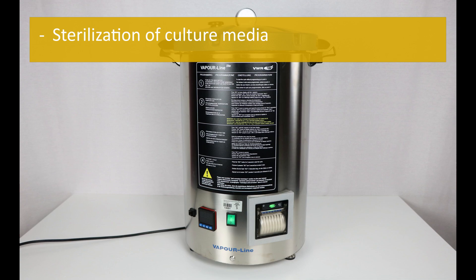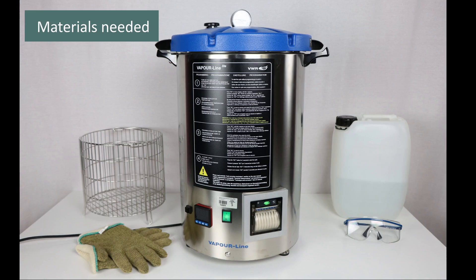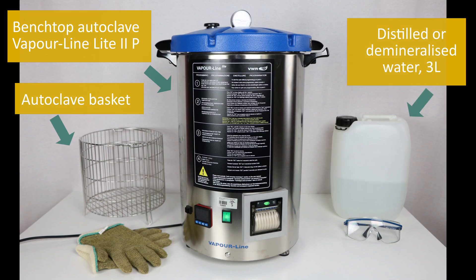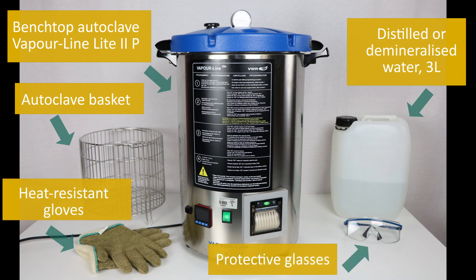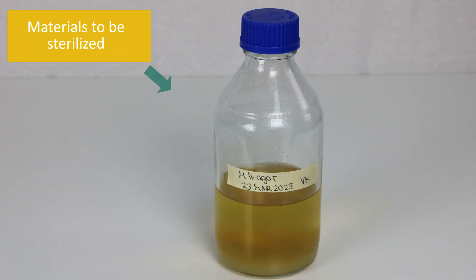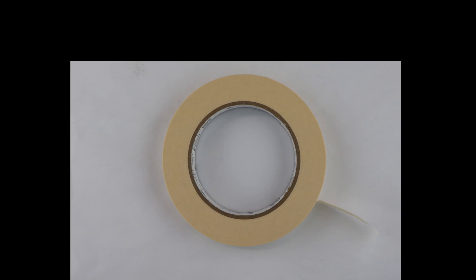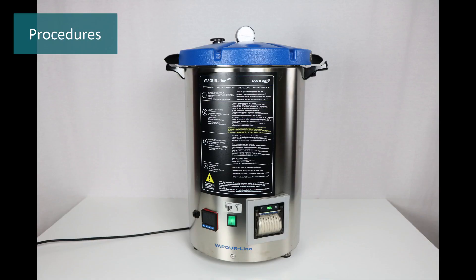Materials needed: benchtop autoclave Vapor Line Light 2P, autoclave basket, distilled or demineralized water (3 liters), protective glasses, heat resistant gloves, materials to be sterilized, steam sterilization indicators, and steam indicator tape to distinguish autoclaved from non-autoclaved materials.